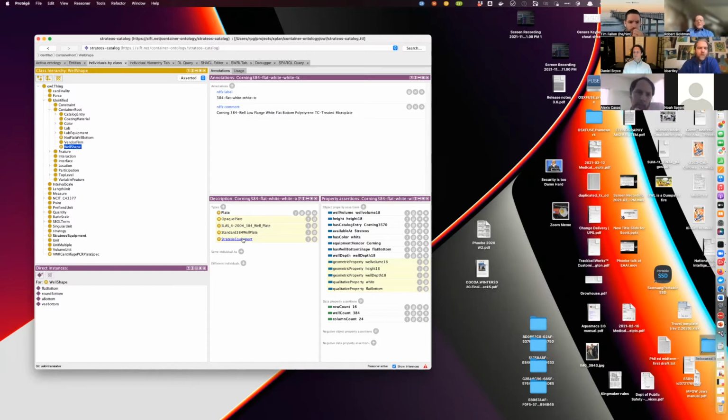Yes, it does. But I was wondering, most of the time when you look at the methods in publications, they specify the exact brand, model name, and all that. But you're saying that in the PAML protocols, we should let the query of the containers be open and query for certain attributes and not put some specific brand name. Is that what you're advocating for? Yeah, that's what I am advocating for.